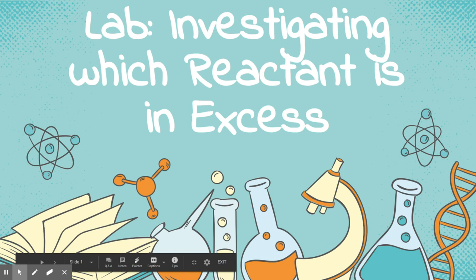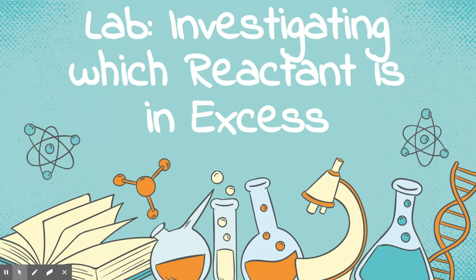Okay, so today in class we did part one of the lab titled Investigating Which Reactant is Excess. Typically, I call this the Limiting and Excess Reactant Lab. So if you see that difference in name, that's how I refer to it.